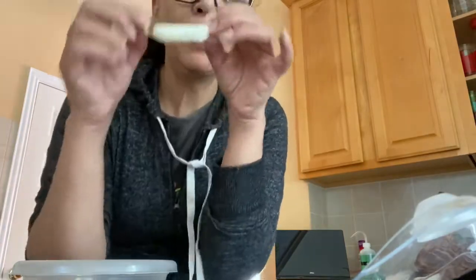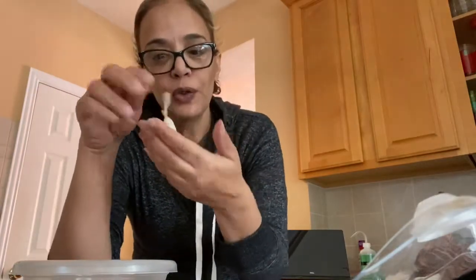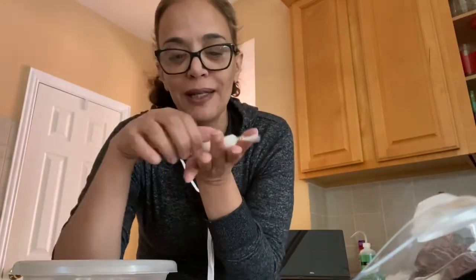Then I will put my bag in, and I'm going to wait 30 minutes, and we are going to see the diffusion of iodine inside of starch. How do I know it exactly? Because iodine will make the starch look black. You remember our experiment with the starch? To know if a solution has starch, we put iodine on it.